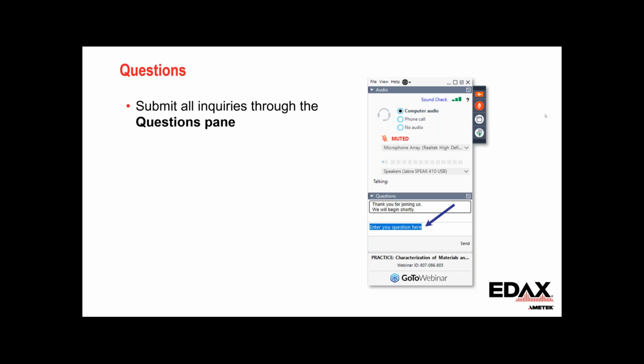And then to wrap it up, we got one more question, and it will be a very hand-wavy answer. It's essentially regarding the upgrade paths for OIM version 9. That will be announced as we get closer to the launch of that product. There'll be some more details available. We're not really prepared to say exactly what the paths are from different versions, but that information will be available to us.